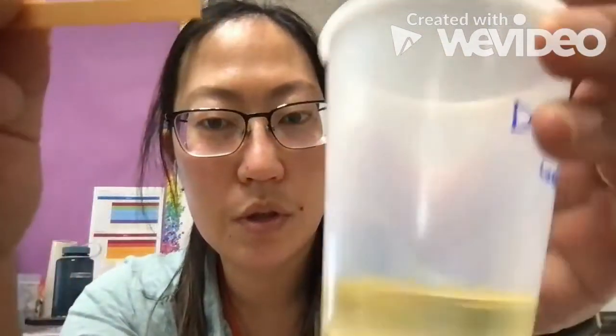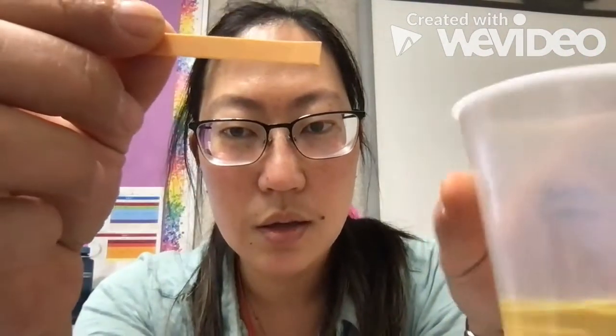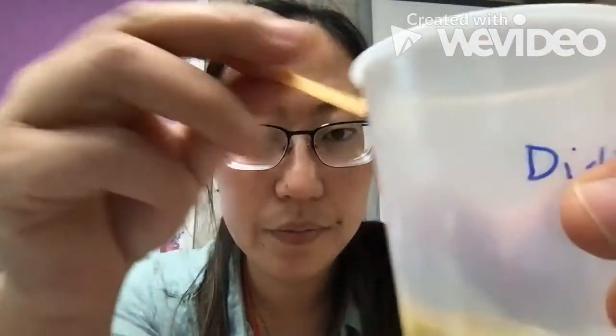Okay, so for part 3, we are going to measure pH 3 different ways, and we're going to measure the pH of distilled water, dry ice in water, vinegar, and ammonia. So we'll start off with distilled water, and we're going to first measure the pH using these pH strips. Okay, so I've got some distilled water here.